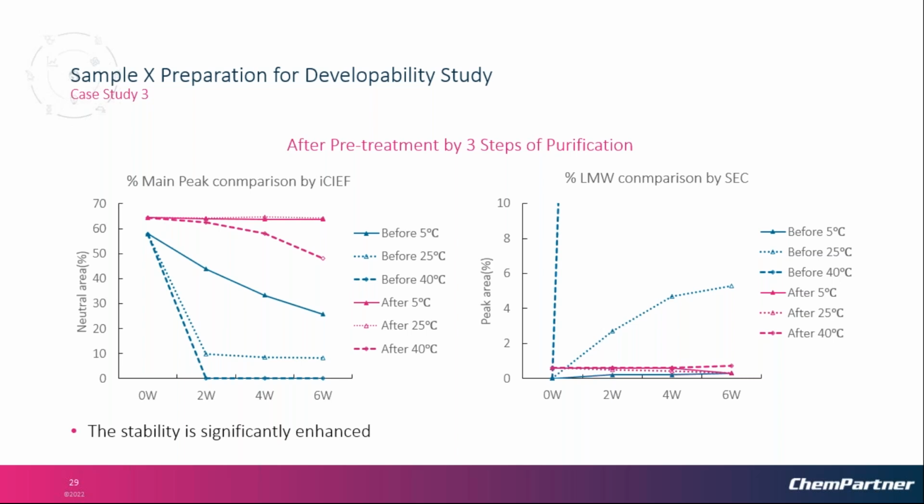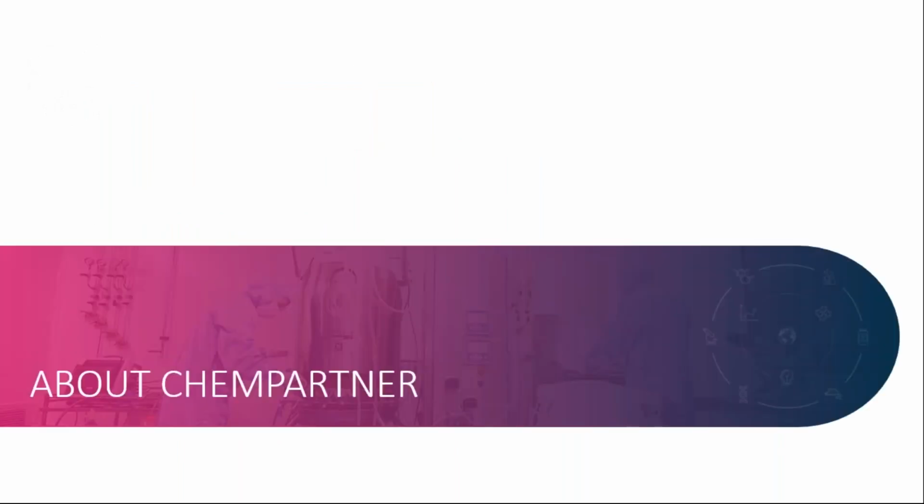So actually, the stability profile of this molecule should have been very good. Then after this case, in the following projects, we required samples with at least more than 2 steps of purification to prevent false judgment. So all this above is our work in the antibody developability assessment.